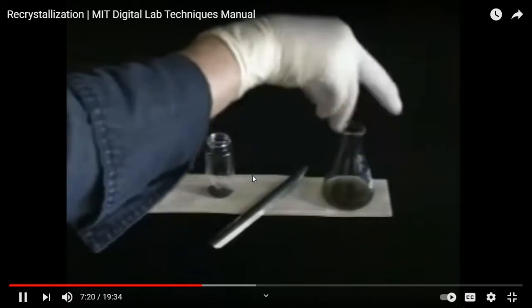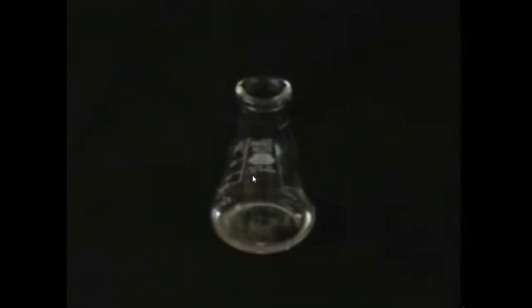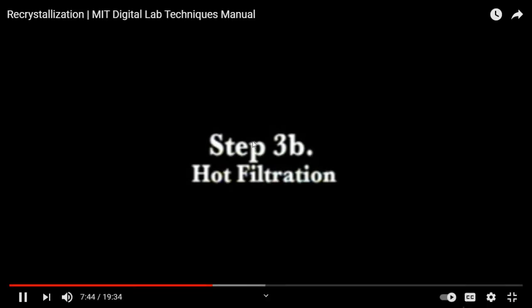Add only a small amount, swirl the flask, and heat it once again for 2 to 3 minutes before performing a hot filtration. If the solution is colorless, the decoloration step is unnecessary, but you still need to look carefully for any undissolved solid in the flask. If you find any, it can be removed by performing a hot gravity filtration with fluted filter paper.